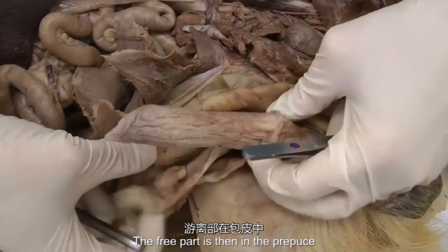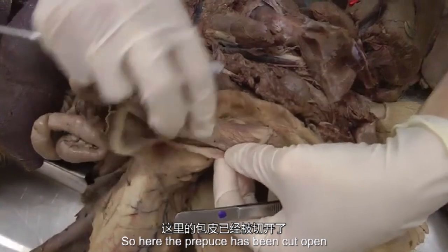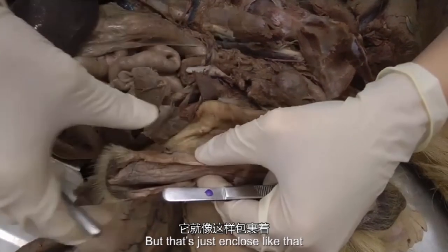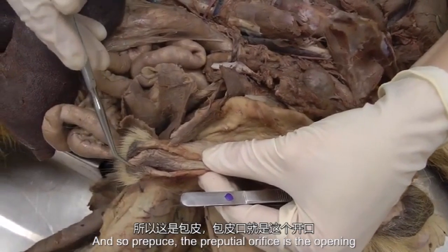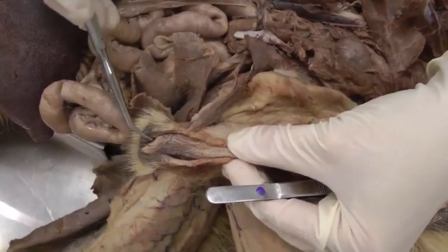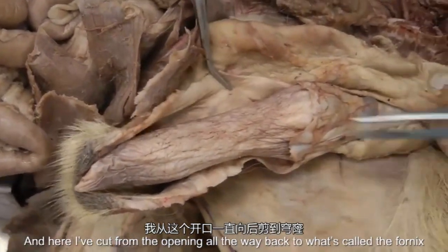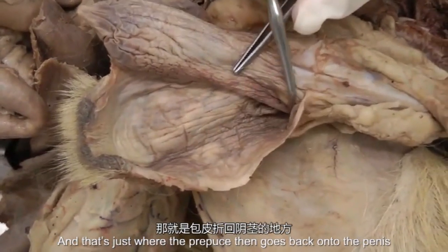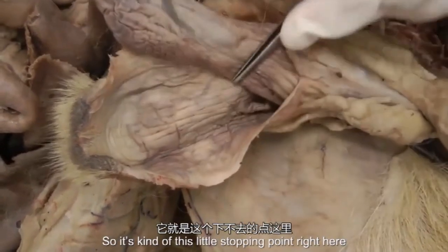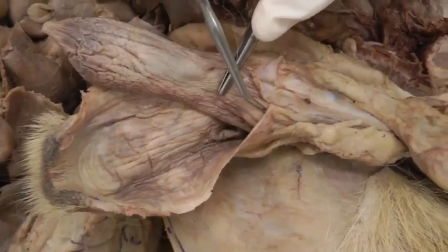And the free part is within the prepuce. So here the prepuce has been cut open, but that just enclosed like that. And so prepuce, the preputial orifice, is the opening. And here I've cut from the opening all the way back to what's called the fornix. And that's just where the prepuce then goes back onto the penis. So it's kind of this little stopping point right here. So this would be the fornix.